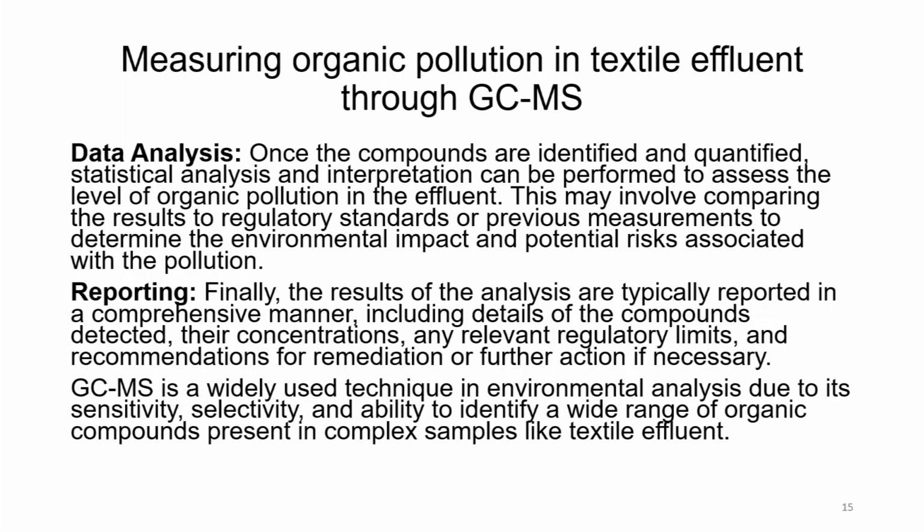Reporting. Finally, the results of the analysis are typically reported in a comprehensive manner, including details of the compounds detected, their concentrations, any relevant regulatory limits and recommendations for remediation or further action if necessary. GCMS is a widely used technique in environmental analysis due to its sensitivity, selectivity and ability to identify a wide range of organic compounds present in complex samples like textile effluent.